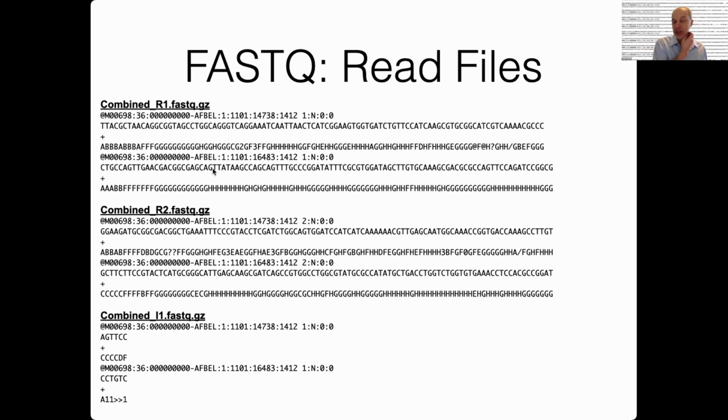And as these sequences come off the machine, I'll just say that this is specific for Illumina data here. The sequences in each of these three files are in the same order, right?